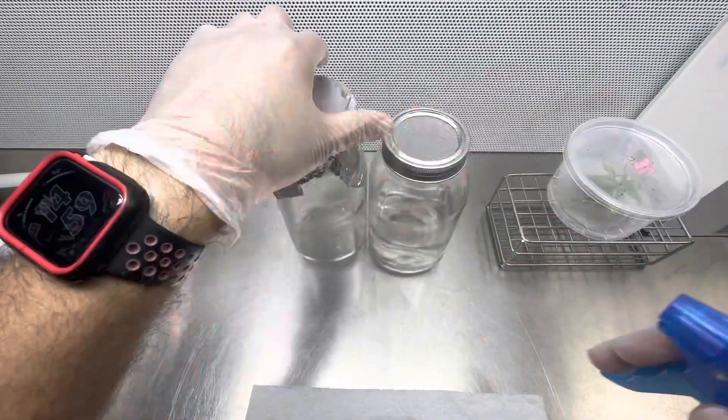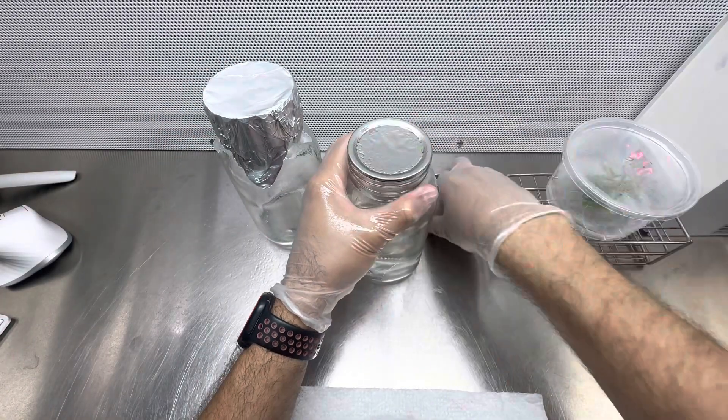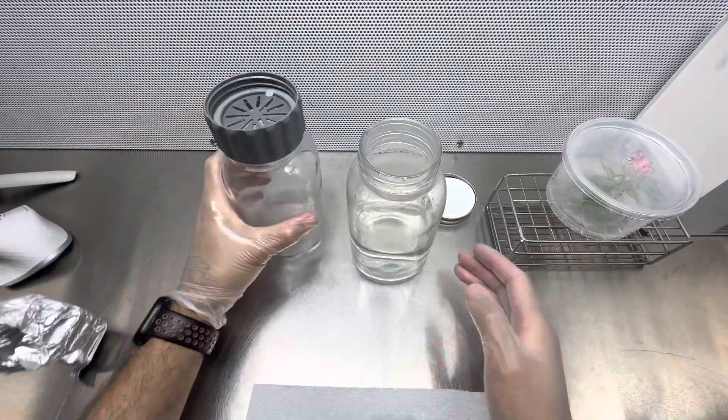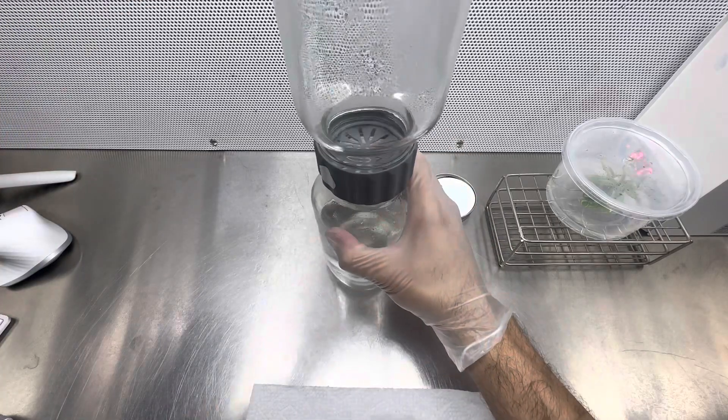Now that the biocouplers and the media have been sterilized, it's time to place them together. I spray everything with 70% isopropyl alcohol to keep everything sterile, then remove the foil from the biocoupler and place it on the jar with the media.